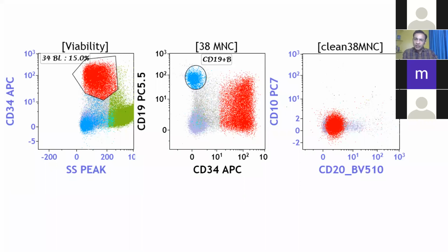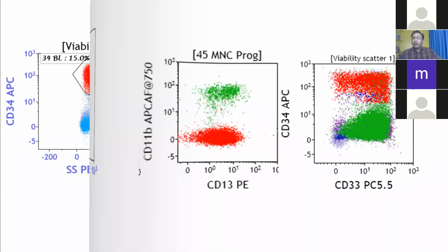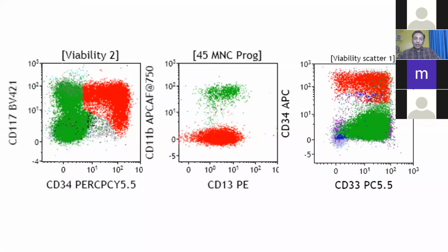Now just CD19 weak expression indicates that CD19 is positive, but it is not strong enough to call it B cell lineage. So we look at other B cell markers. Other B cell markers include CD10 and CD20, but both markers are negative. So CD10 is already out, CD20 is already out. Okay, now we have only one B cell marker. Now we look at other markers, like myeloid markers.